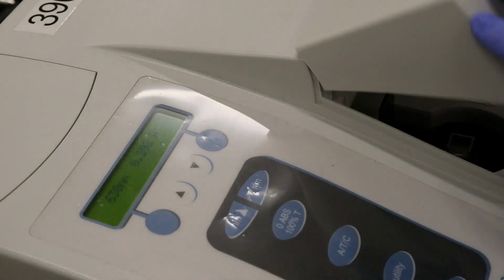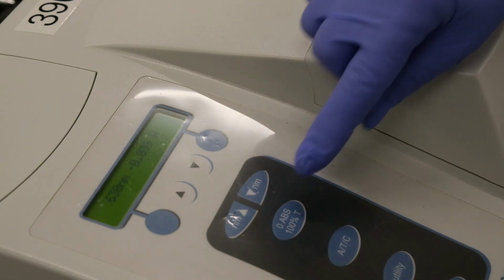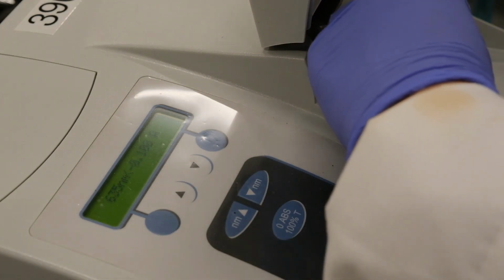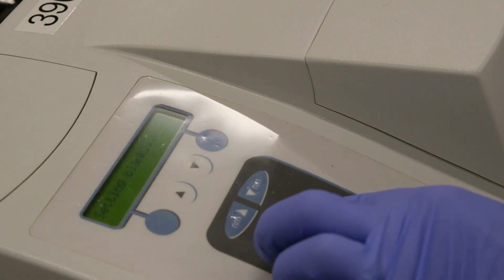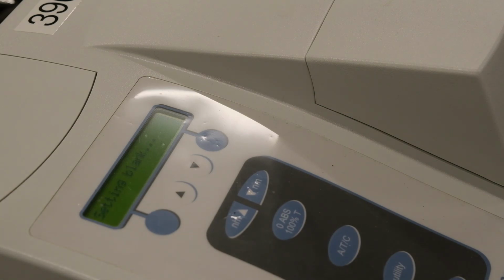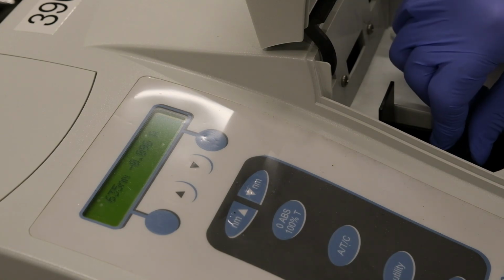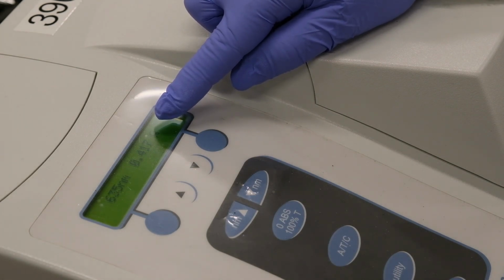We measure the blank again, one more time. We go 5 nanometers above and 5 nanometers below, so let's go up 5 nanometers. Measure the blank. This is the value, 5 nanometers above.